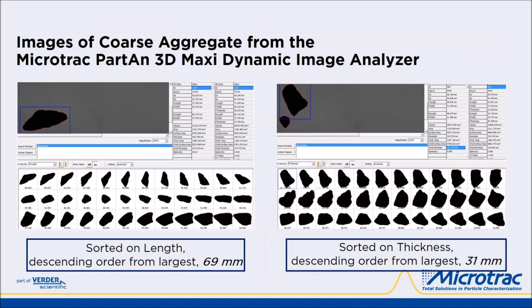Here we're showing views of the image file displays on coarse aggregate from automated 3D image analysis. More on the method later, but each row shown here consists of different random projected photos of one particle as it drops through the sensing zone. The images are sorted in descending order. The largest length on the left is 69 millimeters. The largest thickness on the right is 31 millimeters.